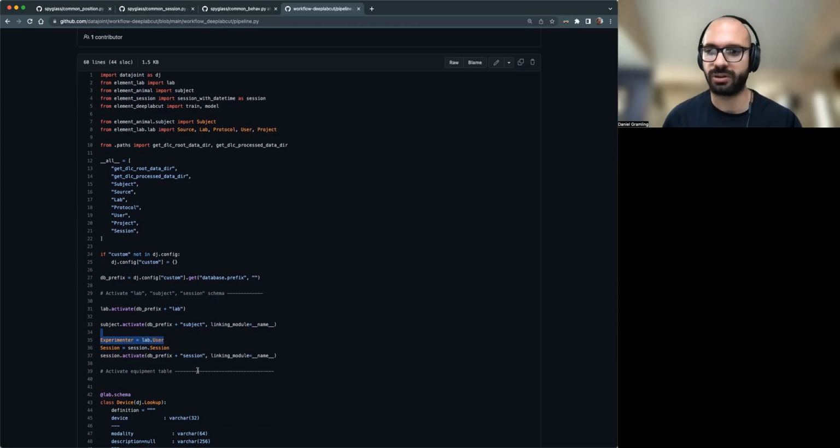Okay. Yeah. Just a really quick question before you dive too deep: what does activate actually do? Because I don't think in our pipeline we ever use an activate command. So there are two features of the elements that facilitate this parent-agnostic effect. The elements don't know what pipeline they're being connected to upstream. One of those is activate, so let's pull up the element.